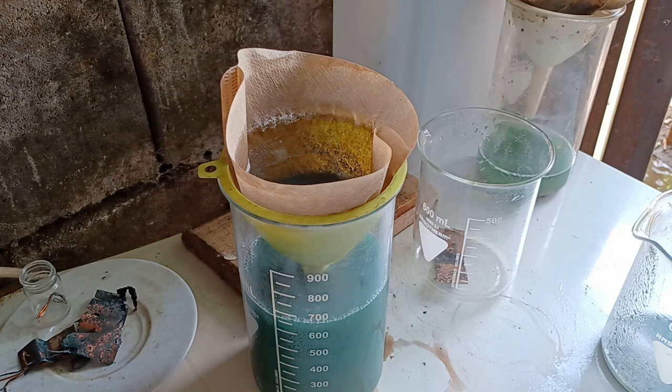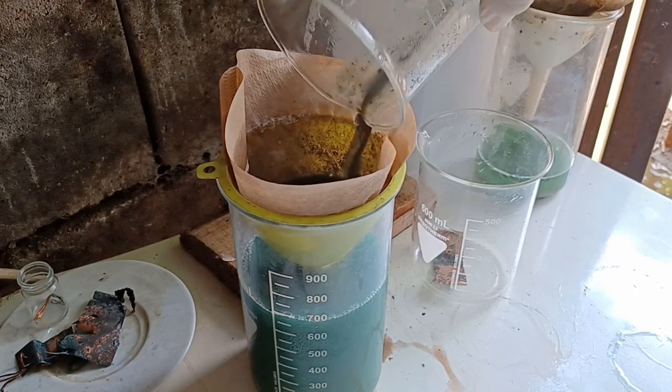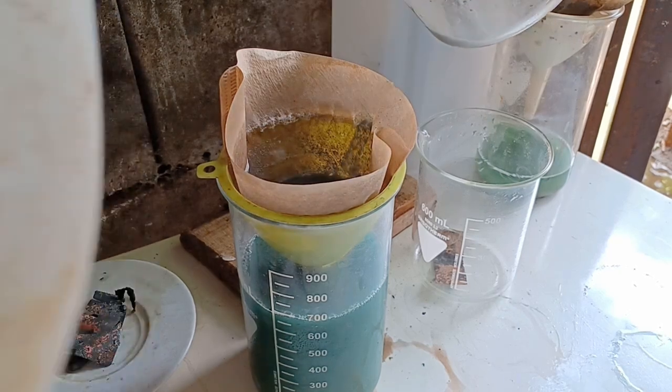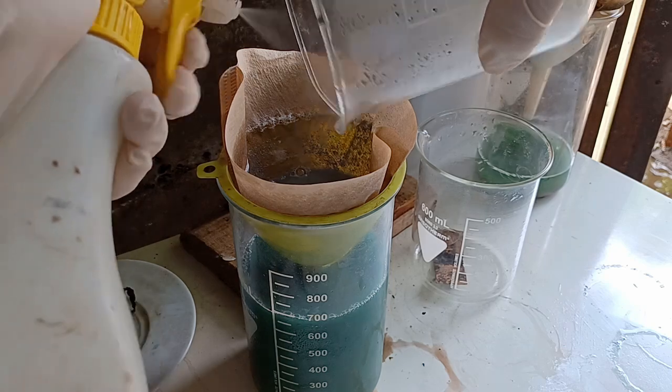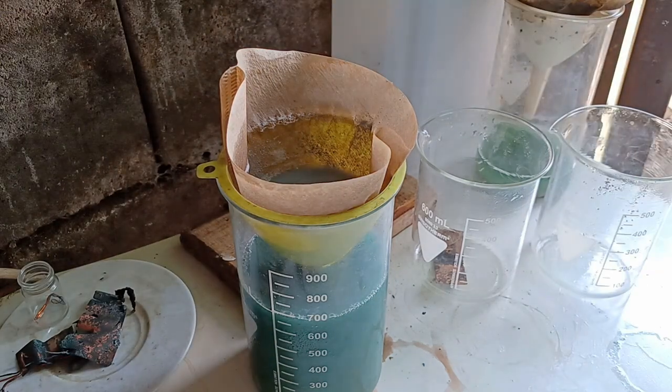Normally I could simply dry it and wait to get the yield. But this time I saw that a lot of ceramic broke down and formed a fine powder that passed straight through the filter and contaminated my product.